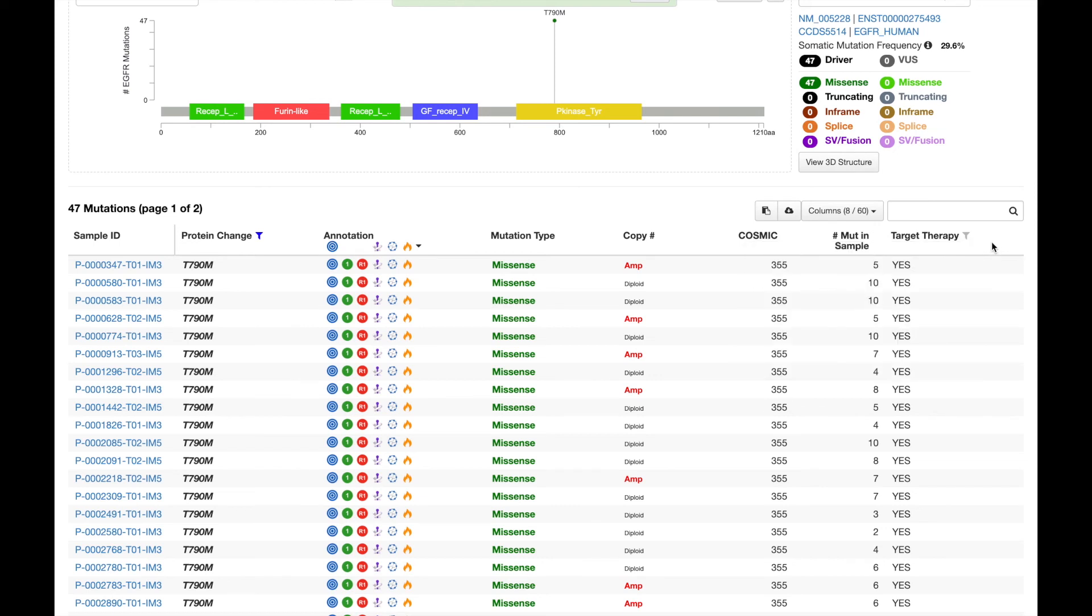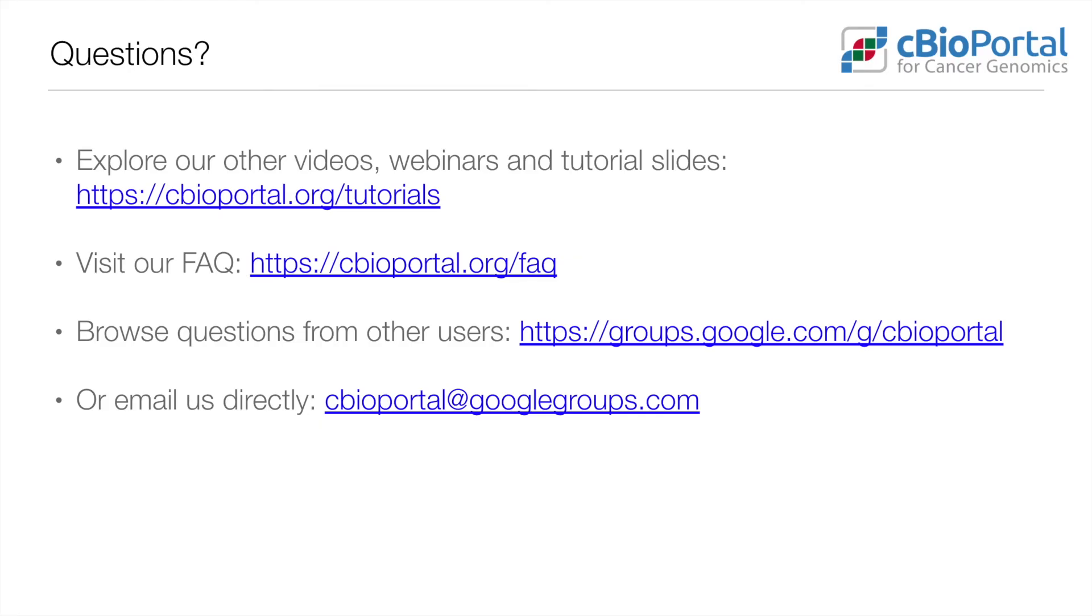Depending on your questions of interest, you can add additional columns of clinical data, or apply filters to multiple columns at once. We hope you found this video helpful. If you have additional questions, please check out the other resources listed here, or reach out to us by email.